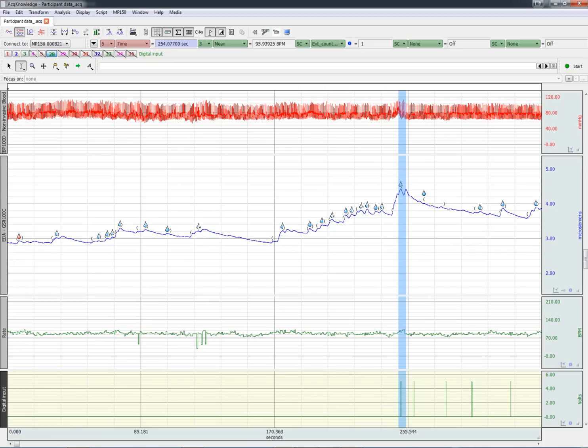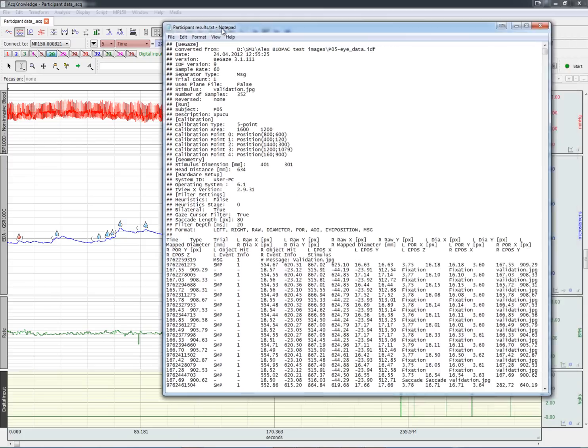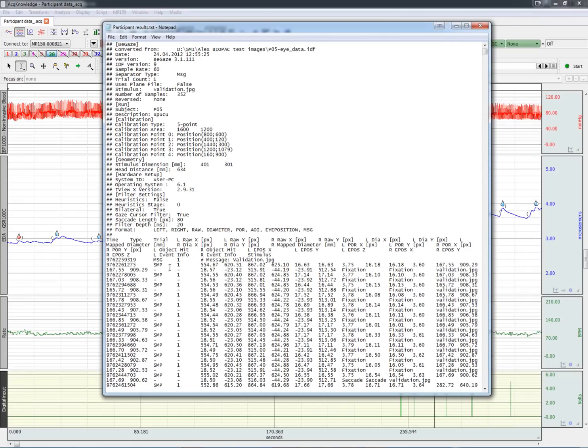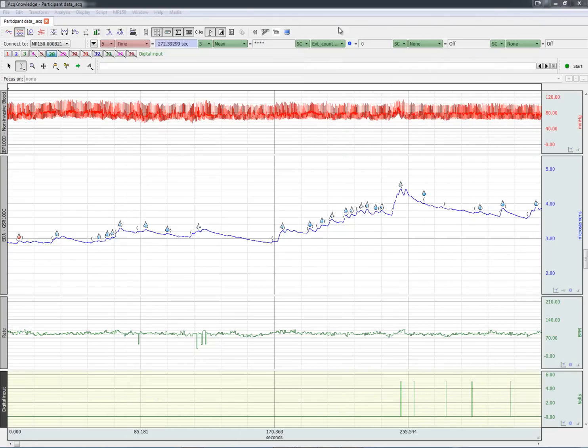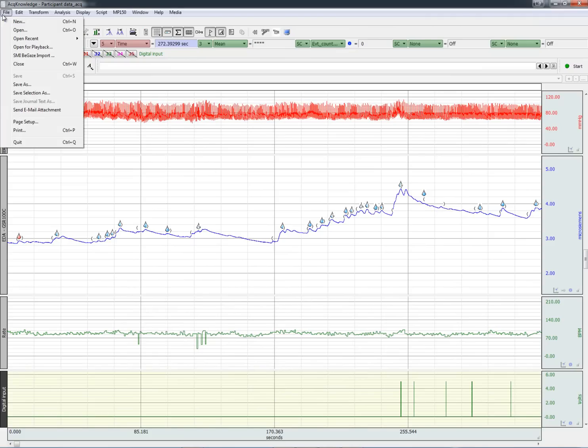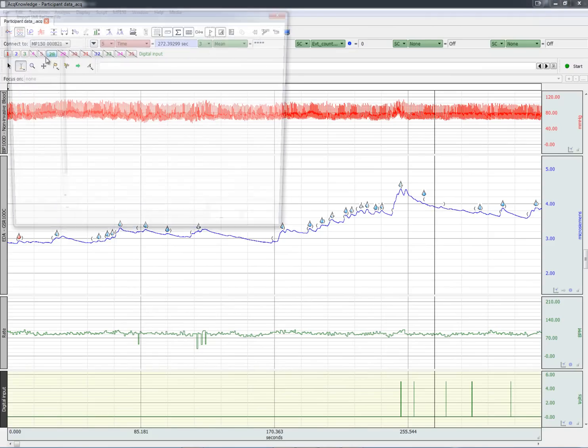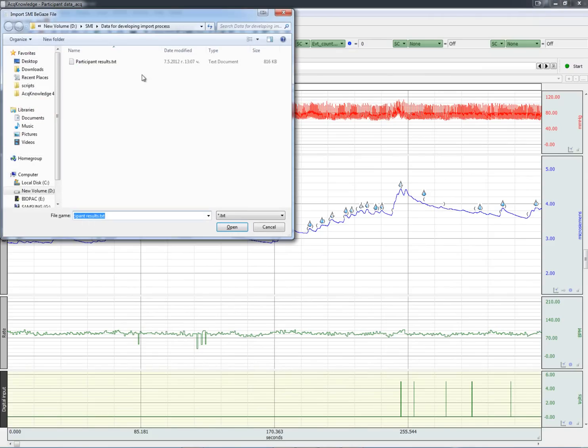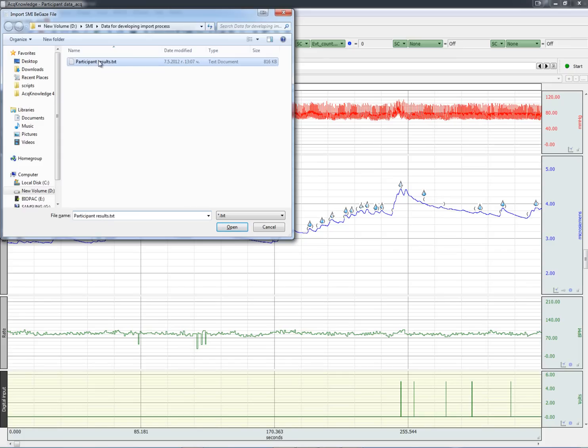The eye tracking data has been exported from Big A's as a text file. We can now merge this eye tracking data into the physiological record. Go to the file menu and choose the SMI Big A's import. Choose the file that contains the exported data from SMI.